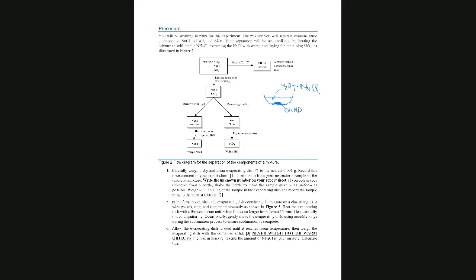So you are going to decant. Basically, you're going to leave the sand in the bottom and decant to a second evaporating dish this sodium chloride solution. So basically, you separate by the water the sodium chloride solution and the wet sand.